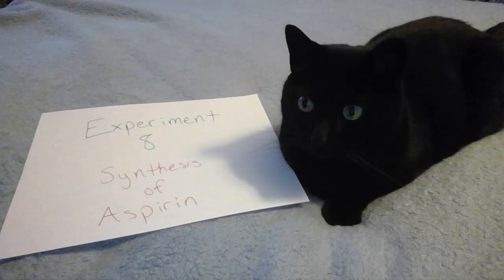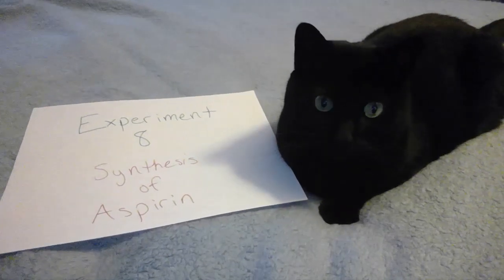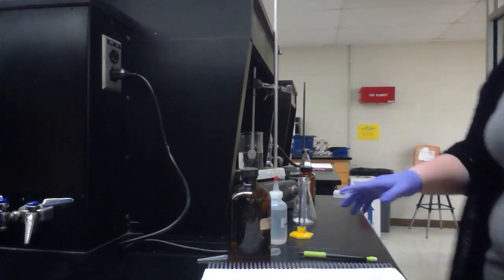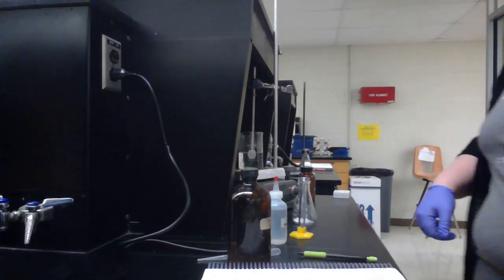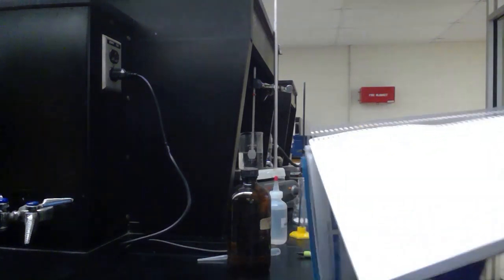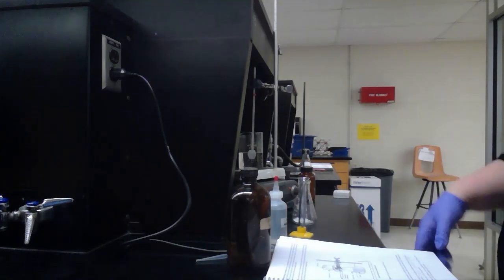This is experiment eight, synthesis of aspirin. Today we're going to be synthesizing aspirin. We're starting in the procedure at the synthesis section, which is on page 215.